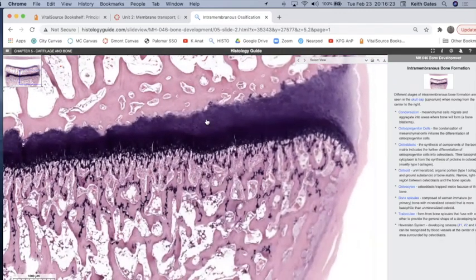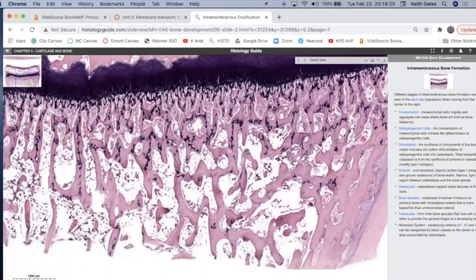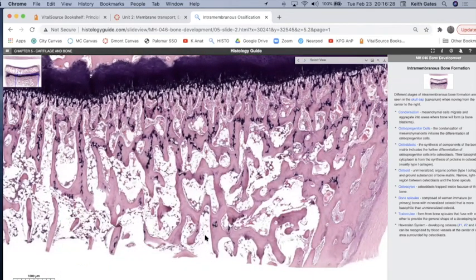So you're saying the trabecula is like the darker lines that I was seeing? Right, so this on the outside over here would be the compact bone, but all this stuff, these are the pores. So all these are trabecula. Oh, that makes sense. Okay. The purple stuff is the last bit of cartilage that's being replaced.